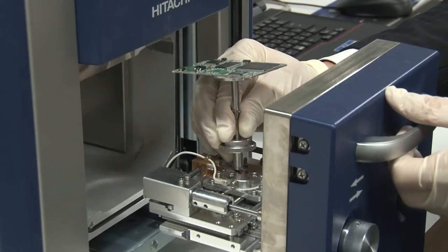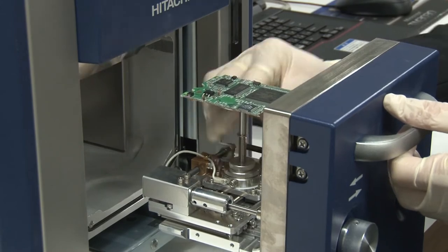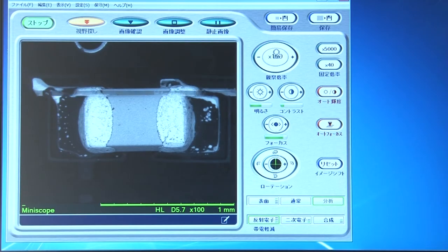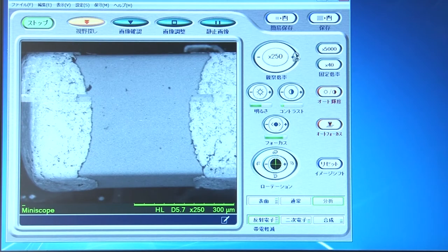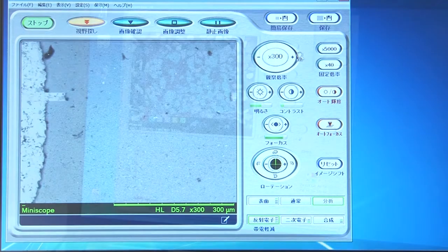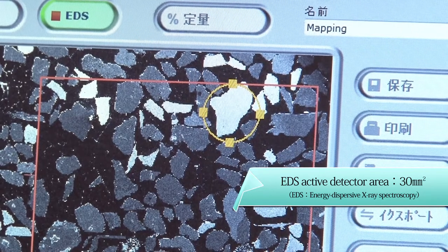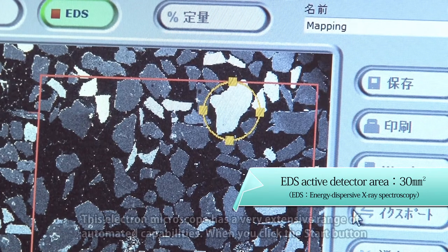Hitachi High Technologies' proven low-vacuum technology creates an optimal working environment for very small samples, enabling bright imaging and fast scanning even in low-vacuum mode. An EDS detector with a 30-square-millimeter detection area is also available as an option, so elemental analysis can now be done even more quickly.